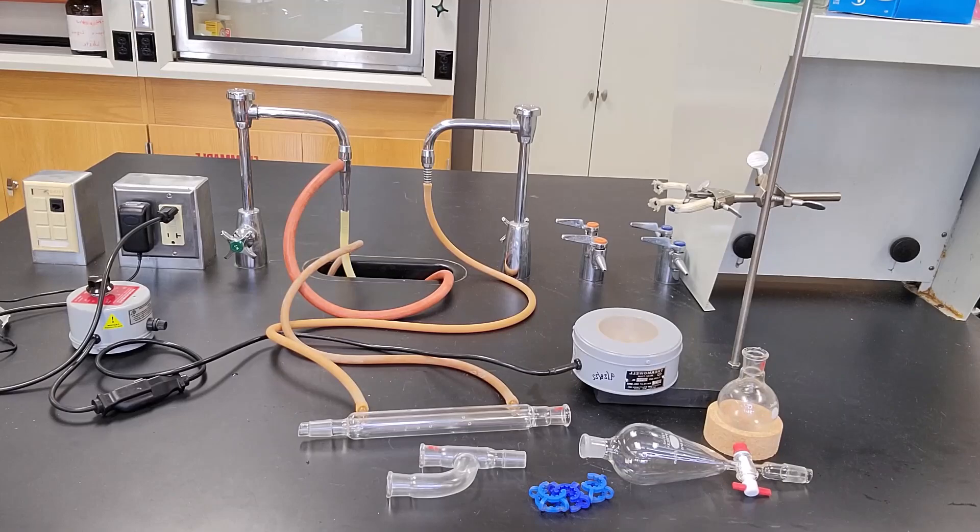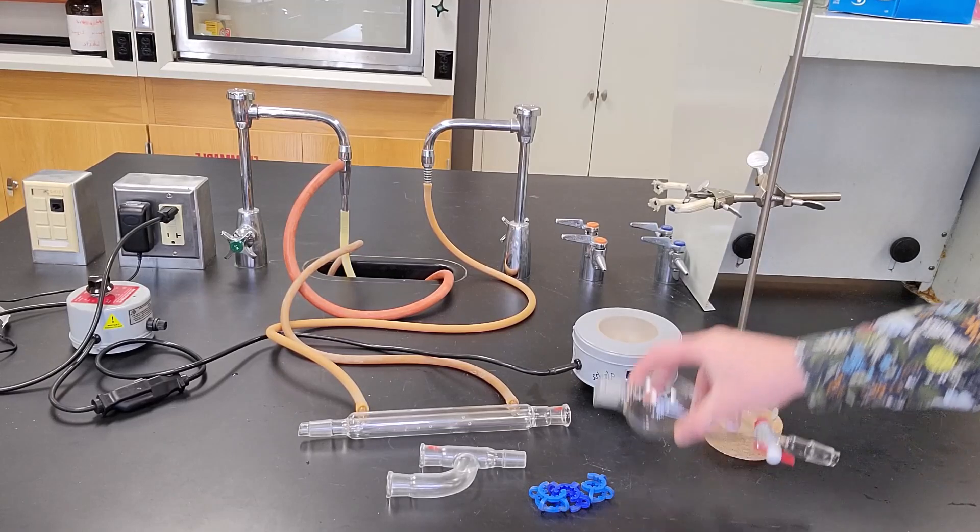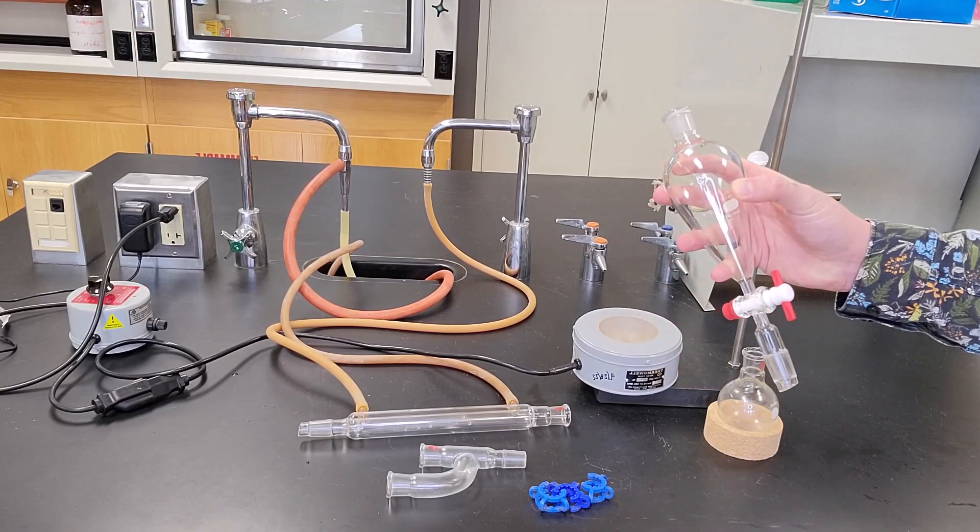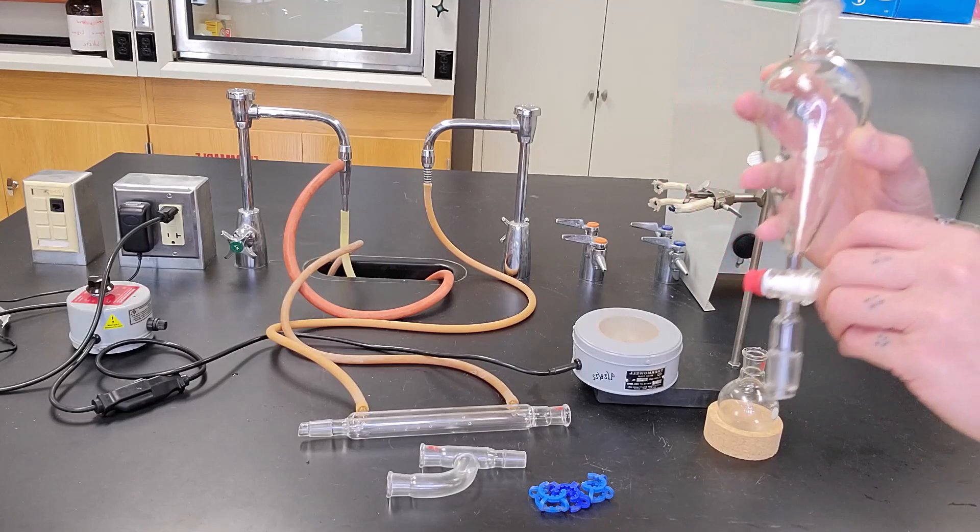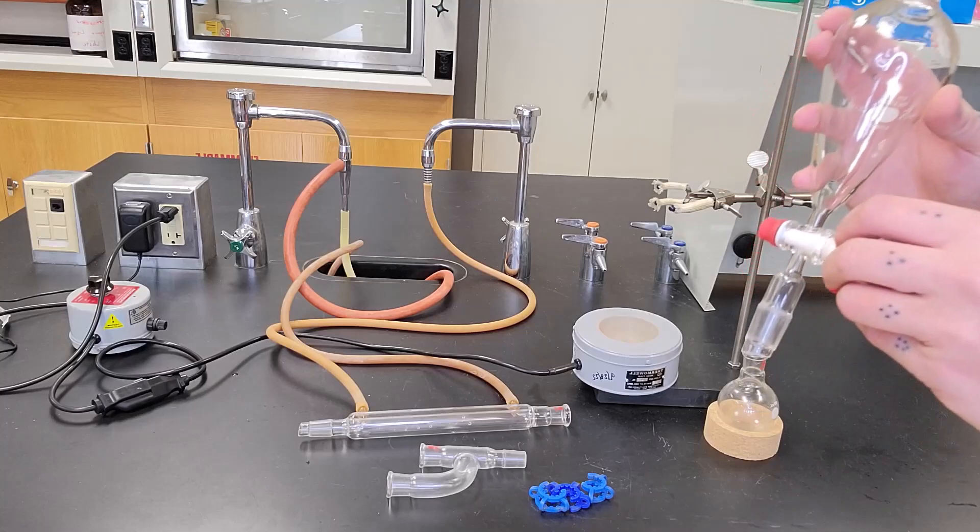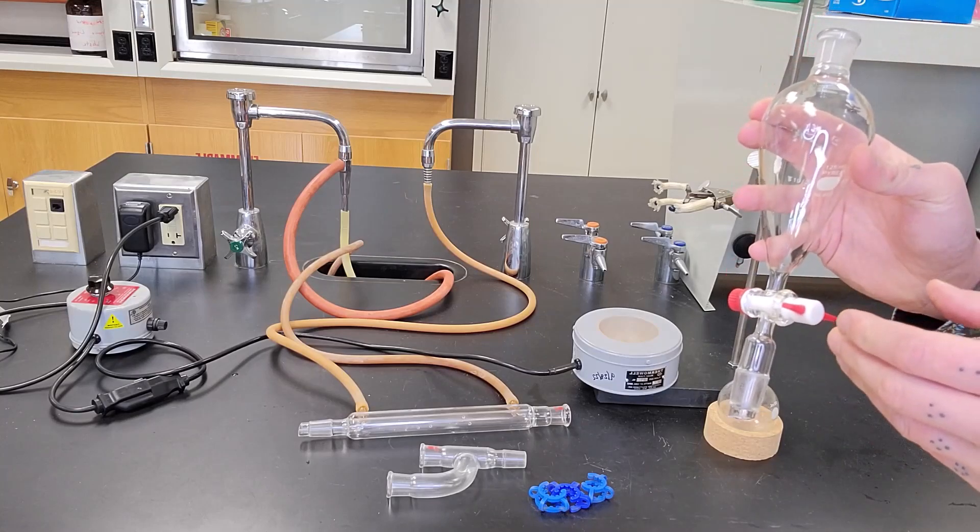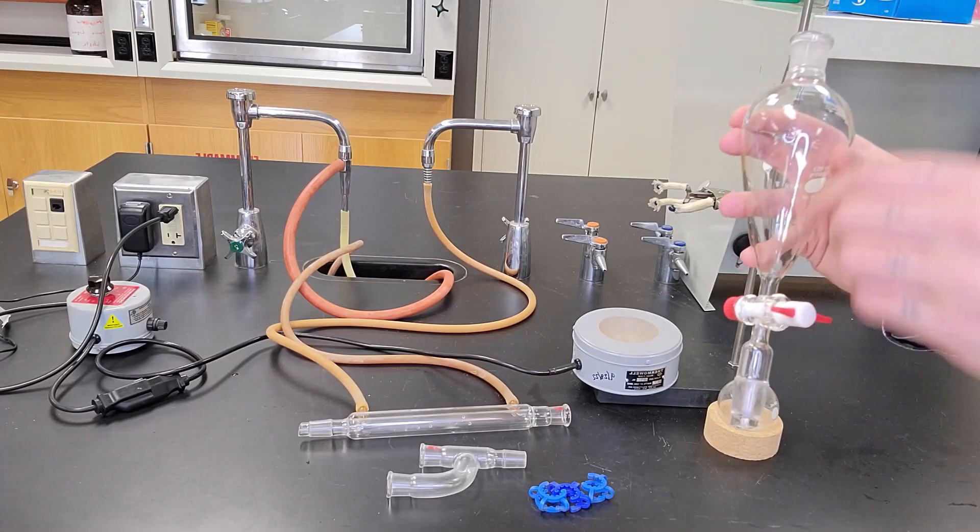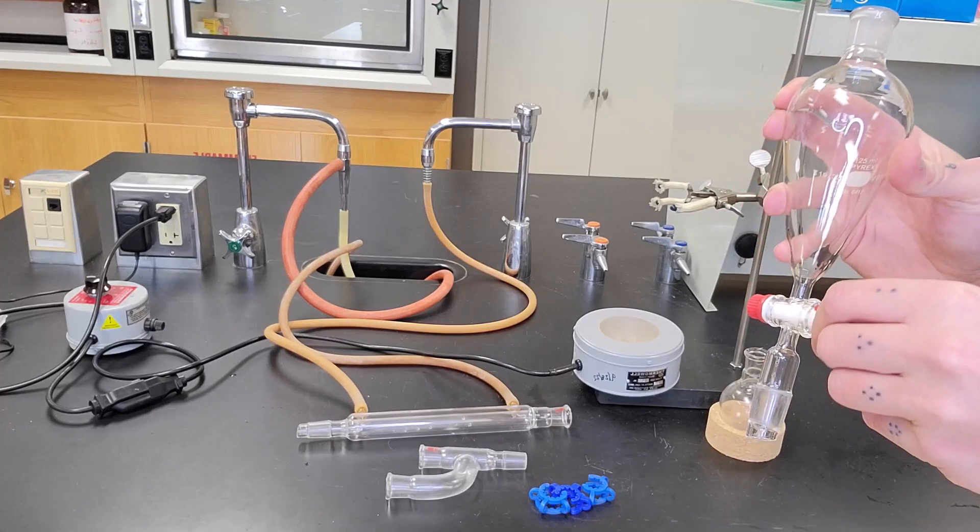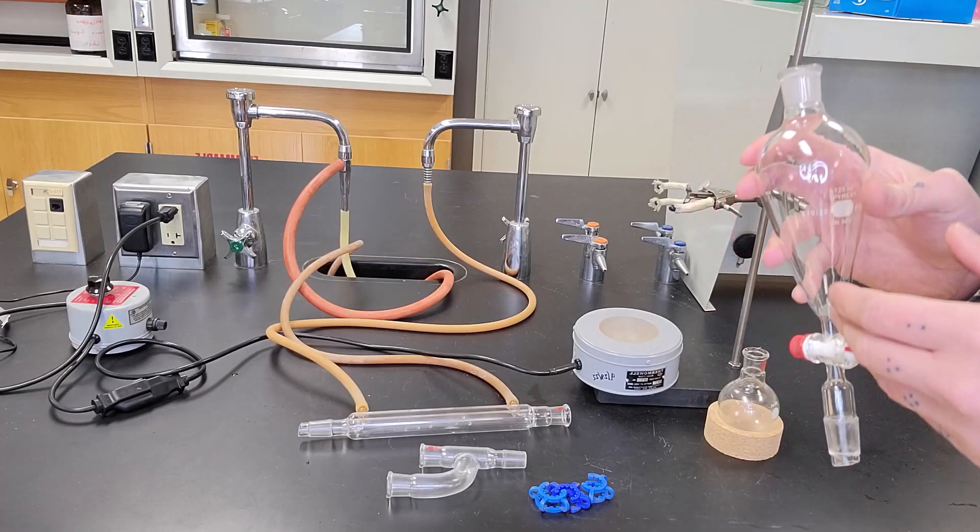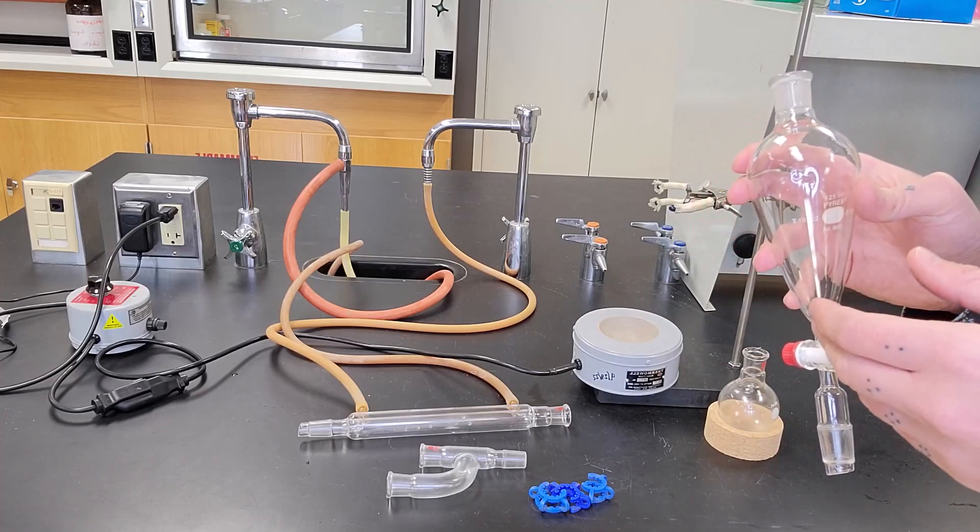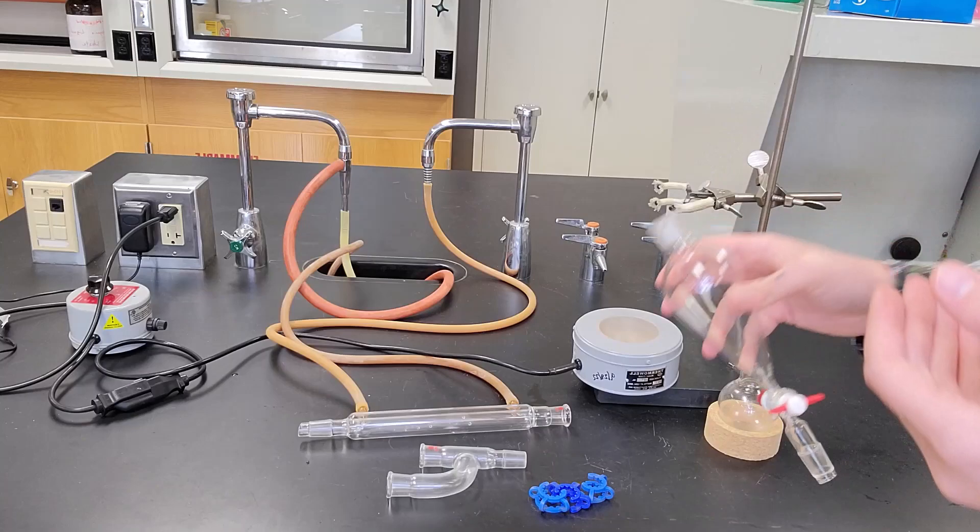So we've already seen this piece of equipment used as a separatory funnel. However, I mentioned that this is not the only use for this piece of glassware. In fact, it can be used very readily and very handily to add solutions or liquids in a slow, controlled, or dropwise manner. And in this case we do not use it as a separatory funnel but we use it as an addition funnel.